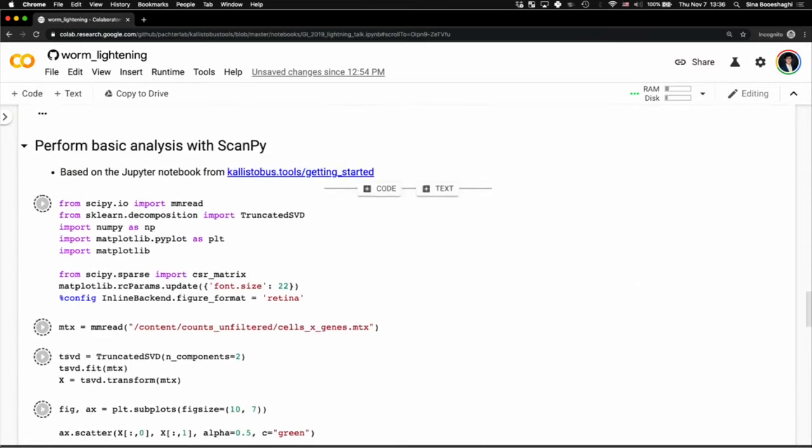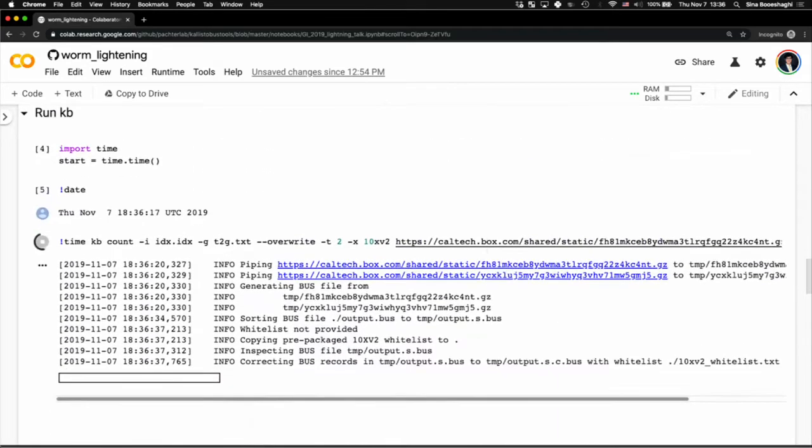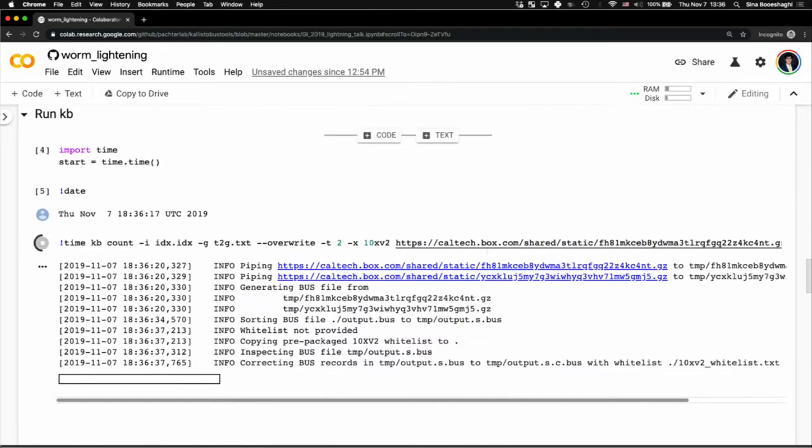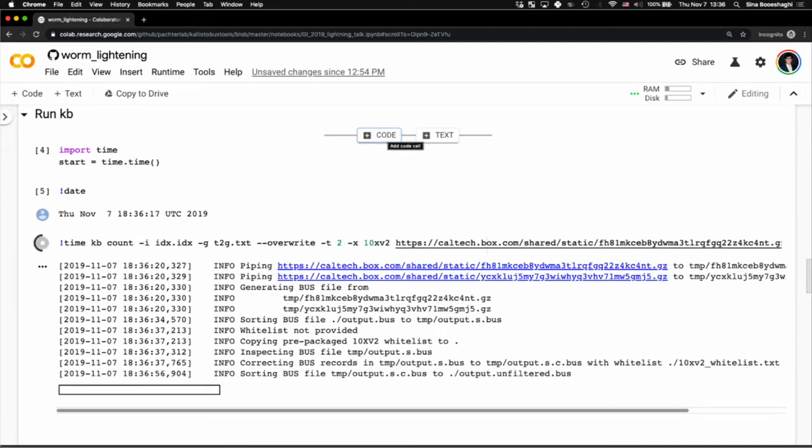So let me show you exactly what we're doing. If we scroll up here, I'll show you that we're actually streaming reads from a box account from Microsoft all the way into this Google Colab notebook, which is a very minimal computer with two threads, 12 gigabytes of RAM, 300 gigabytes of storage.